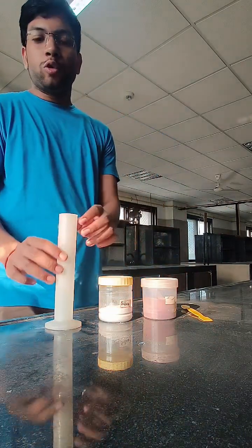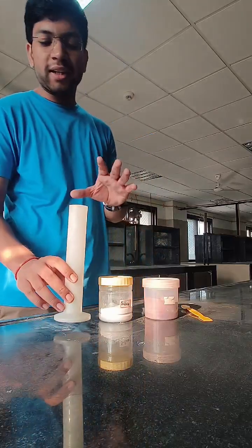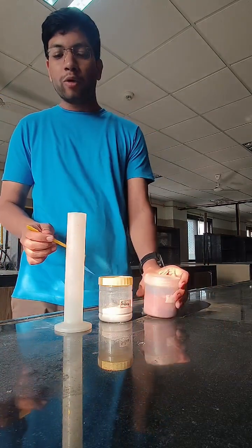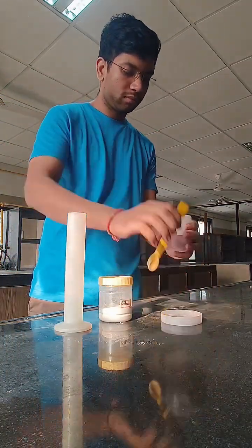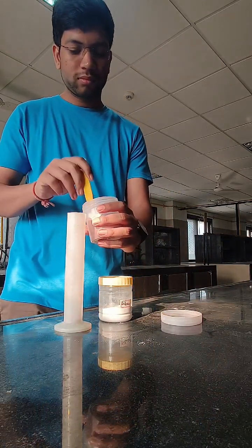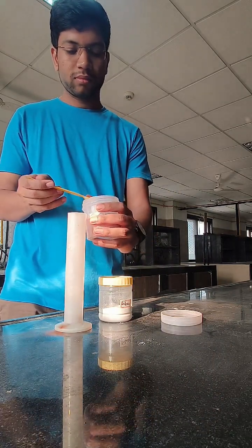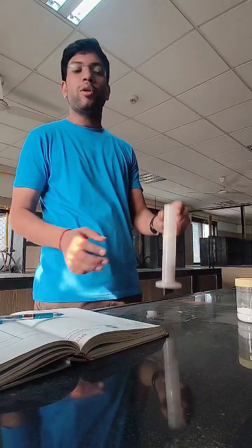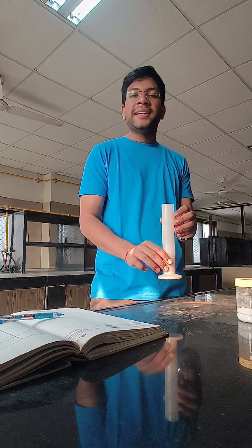The first step is to measure the weight of this measuring cylinder. After measuring the weight of the empty measuring cylinder, we need to pour 30 ml of brick powder into the measuring cylinder. We need to measure the weight of this again. After measuring the weight of this measuring cylinder with brick powder up to 30 ml, now we will tap it 10 times on the floor.